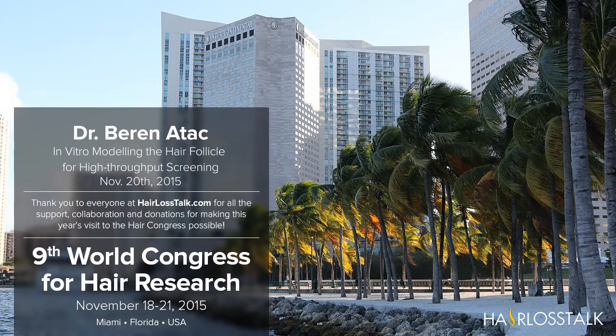lab which produced a microfluidic bioreactor, called the multi-organ chip. Here you see one design that I use. It is a closed system and has on-chip pumps, which allow pulsatile flow like our heart does, to mimic the whole perfusion system. And then there are cell culture compartments where we can culture many tissues, but in this case the microfollicle tissue. This is also possible to combine with endothelium.